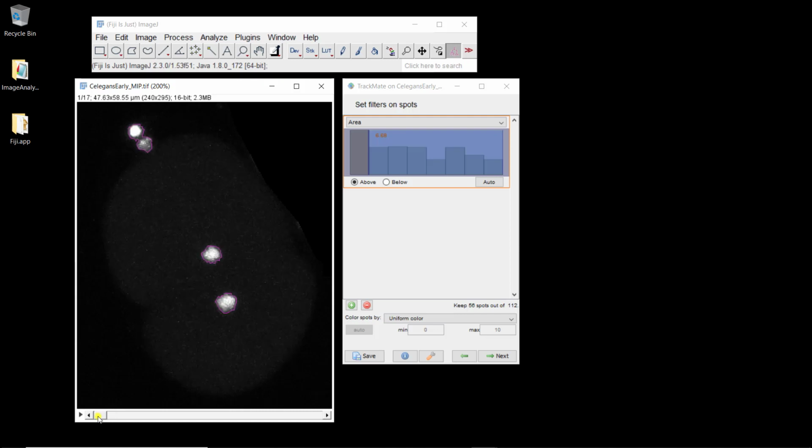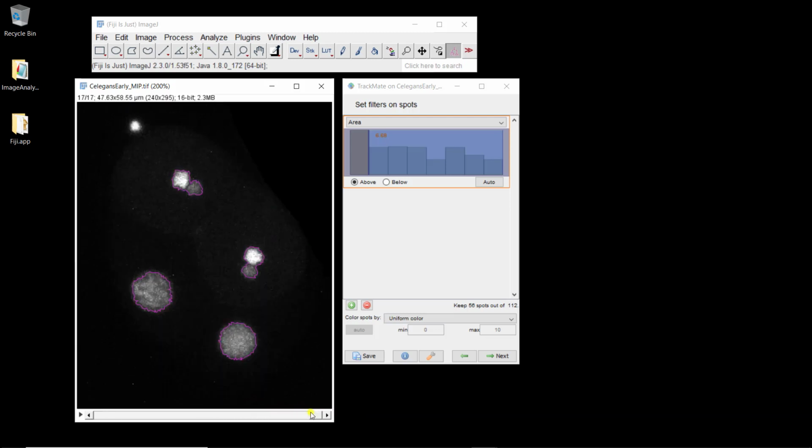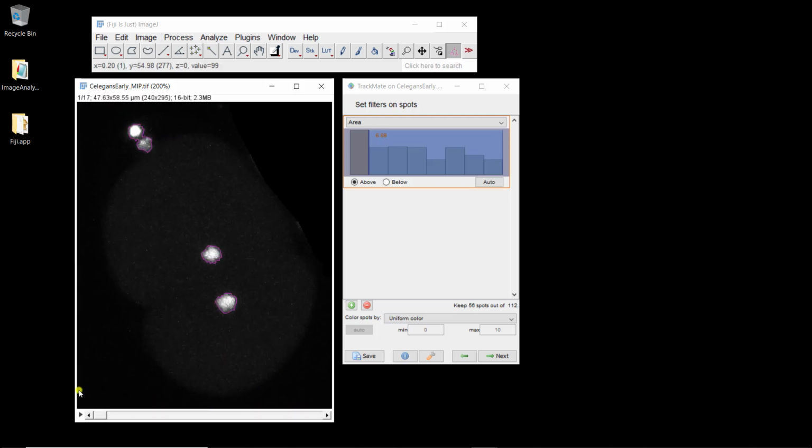So I need to go from the beginning. I have them. And so you see here, I still have this thing which doesn't correspond to cells. I have this thing, but I don't have this one, which is pretty neat. I have this one. I don't have this one. So you see, it's going to be probably easy to get rid of them. And I have the cells all along, which is a good thing. So I'm going to go with this.